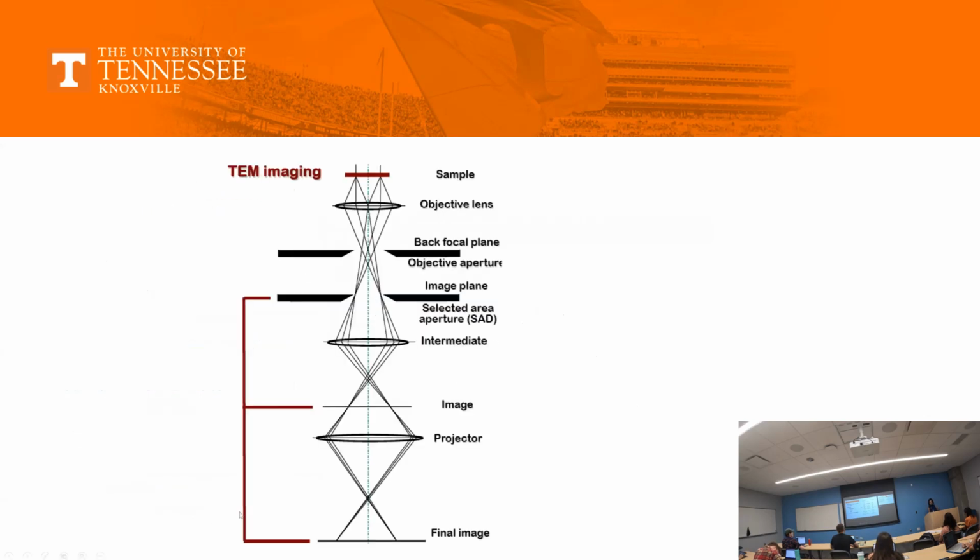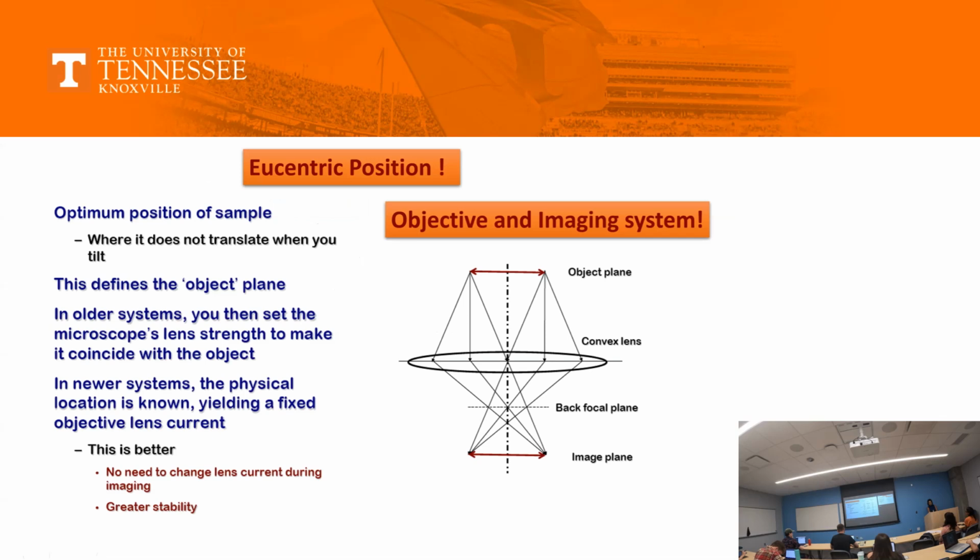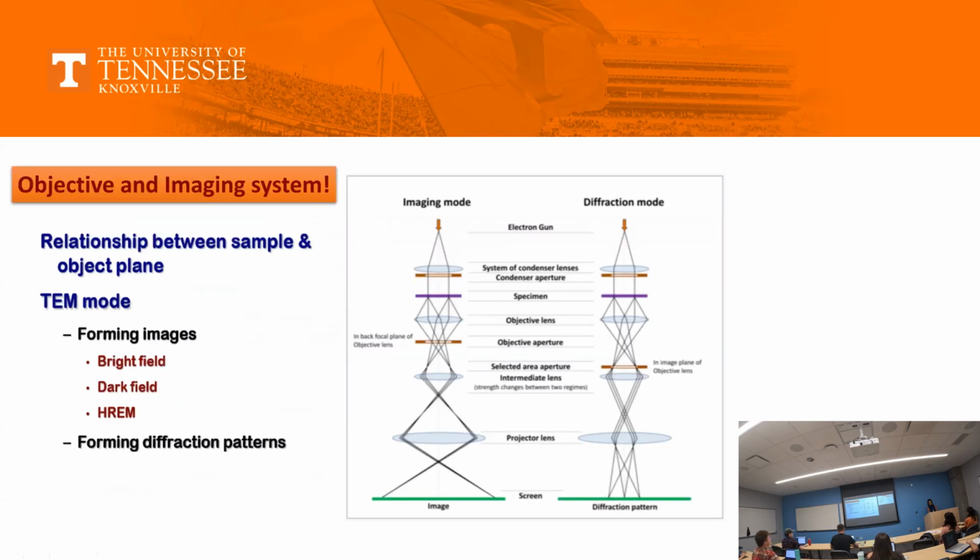Right, exactly. And now, after the condenser part that we did, we are moving to the most important part of your syllabus, that is understanding how the objective works. And in the last class, I told you that the back focal plane is one of the main areas in this entire vertical column that you would always keep in mind.